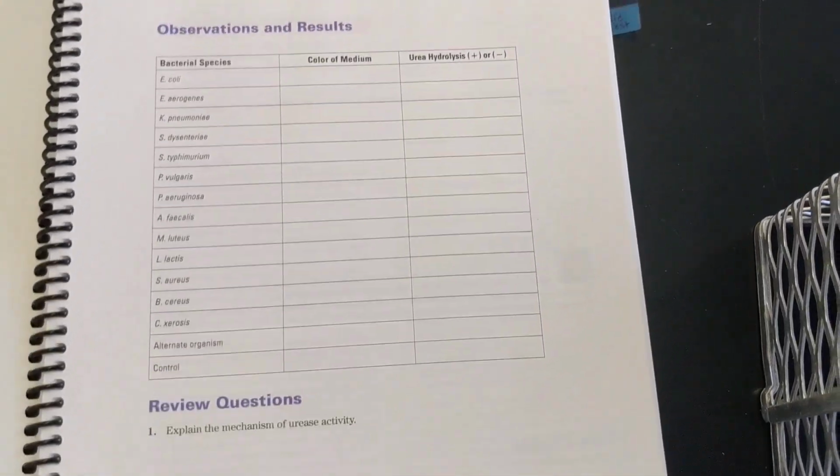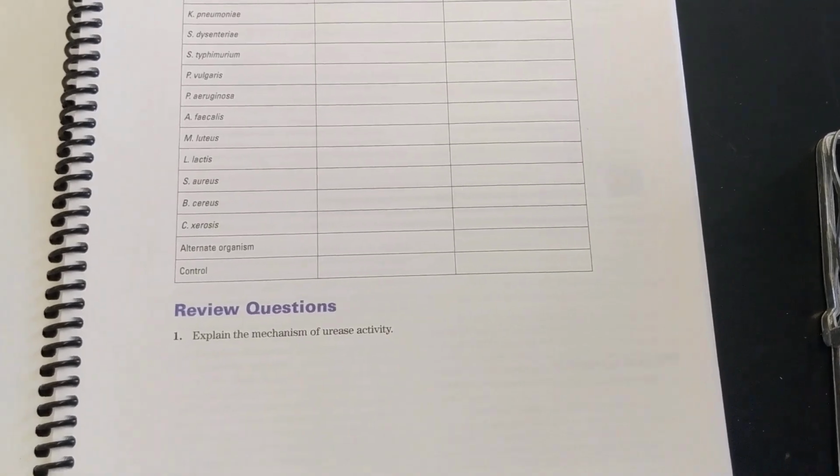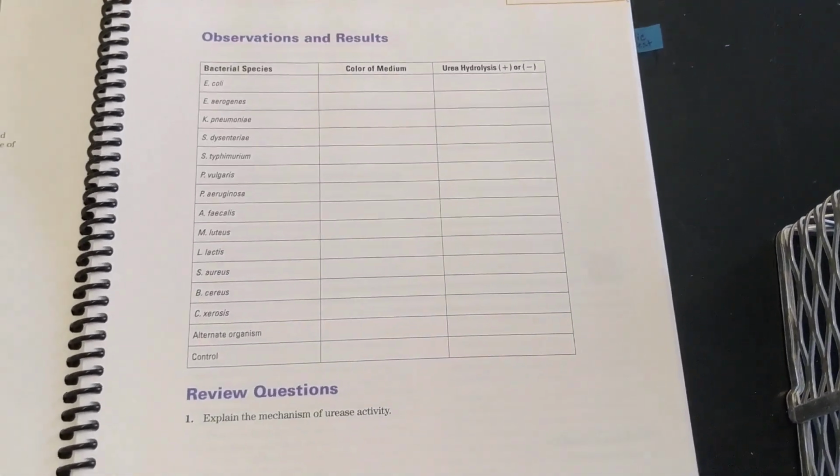So you'll be filling this out. Here, just observations. If it turned pink, it would be urease positive. If it did not turn pink, it would be urease, or urea hydrolysis, negative.